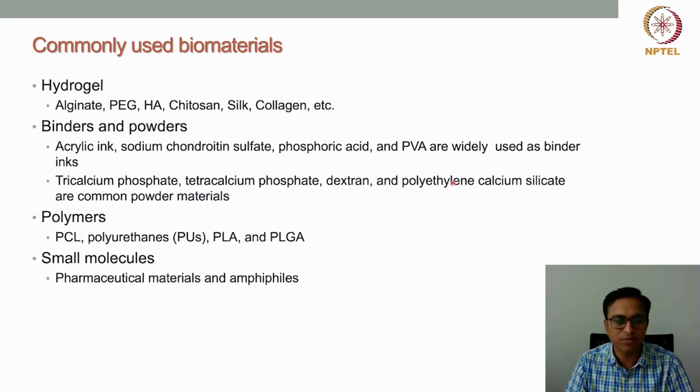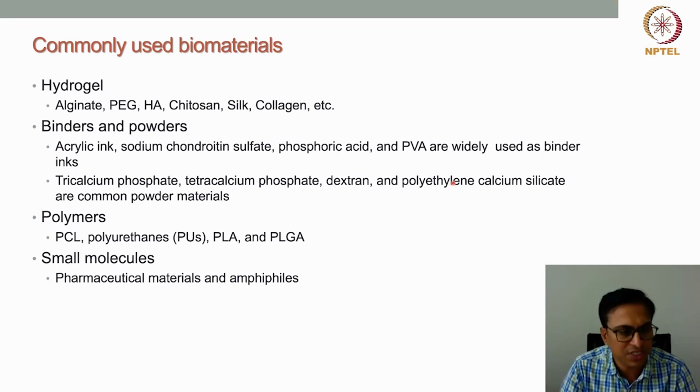Now, when we use an organic polymer solution with a volatile solvent, the solidification process is much easier, because after printing, the solvent can be easily evaporated, and then we get either solid particles or a solid structure. But when we use an aqueous solvent, we need to take care how these polymers get solidified again to make the structure. So to improve the stability of the structures, we need to use one or other of the solidification strategies that we discussed in the earlier slide.